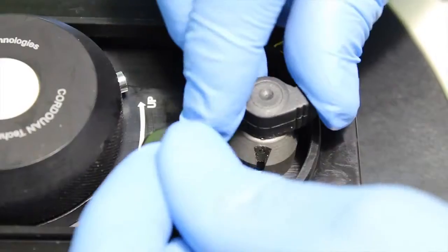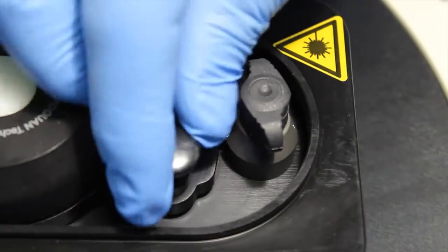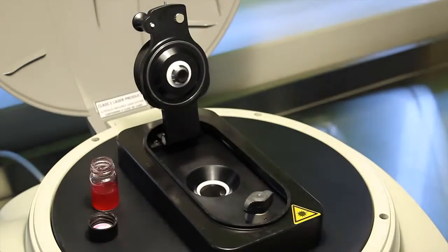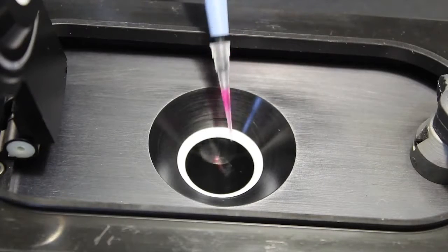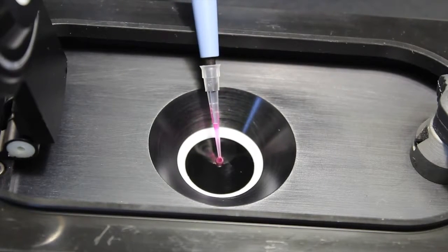Based on an innovative and patented technology developed by the French Institute of Petroleum, the Vasco series covers both diluted and very concentrated samples, either transparent or absorbing.